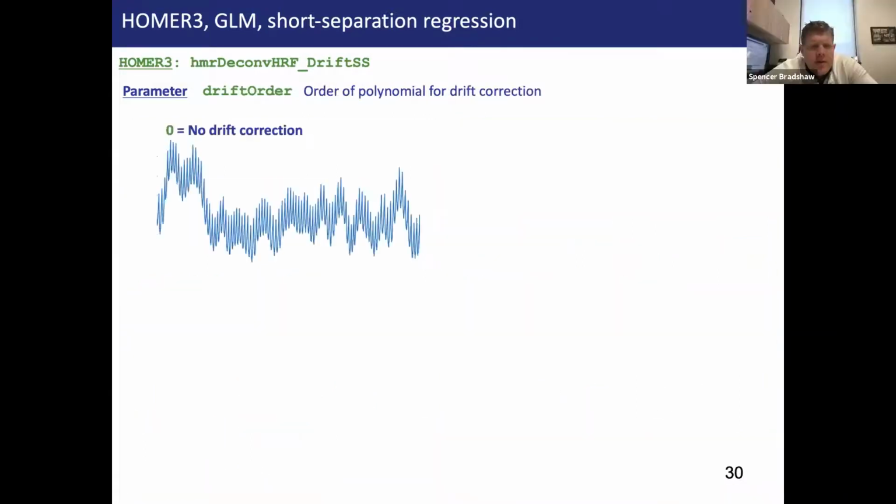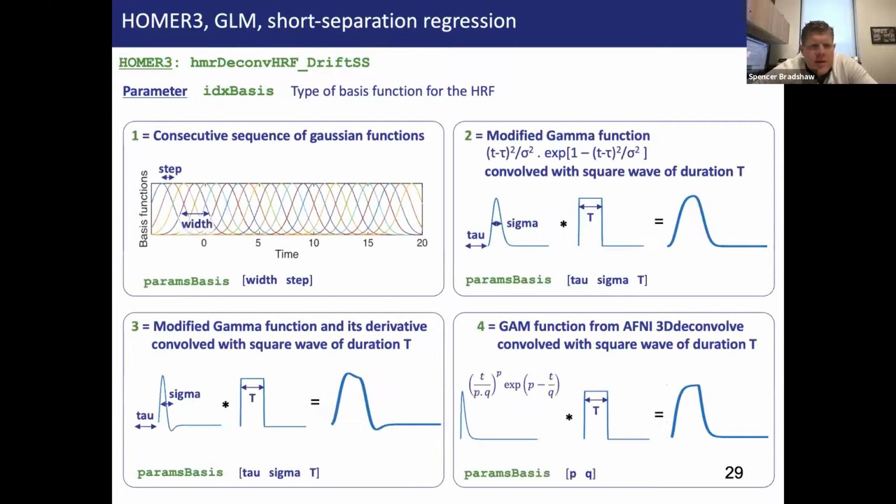David, can you just briefly explain the concept of drift? Of drift? Yeah. The drift can have many sources. It could be just the instrument. Maybe the laser power is slowly varying over time.